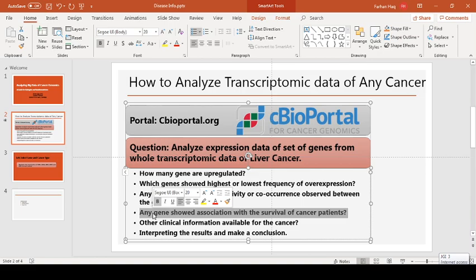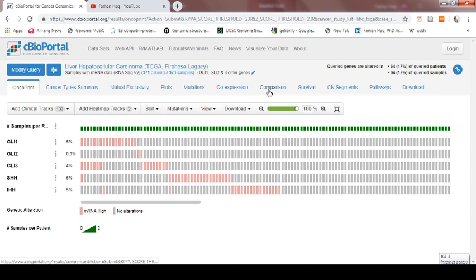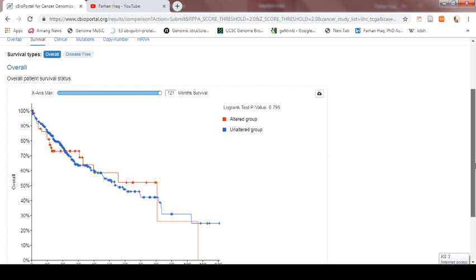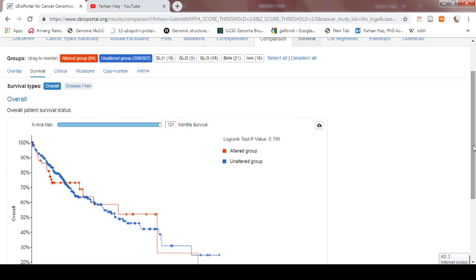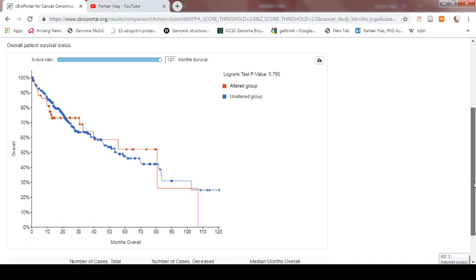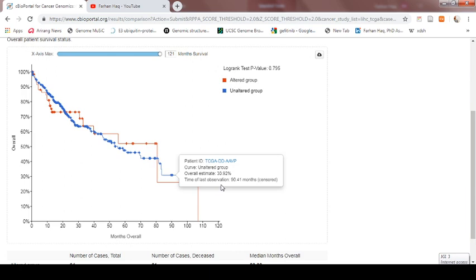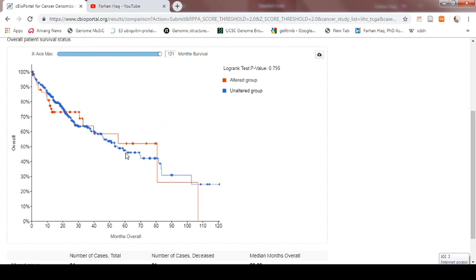The next question is: does any gene show association with the survival of the patient? For that, there is another option here — survival. If you click the survival plot, these plots are Kaplan-Meier plots. It is showing the survival association of the altered group versus the unaltered group. Altered group means the alteration or overexpression of all five genes versus the unaltered group that showed no alteration. The red represents the altered group and blue represents the unaltered group. There is no significant difference because all the lines are overlapping, and that is why it does not show any difference between the altered and unaltered groups for overall survival.